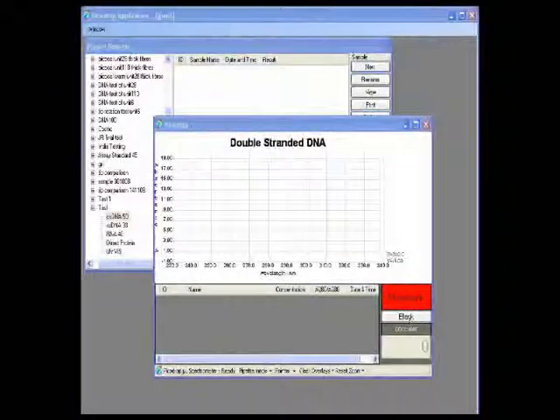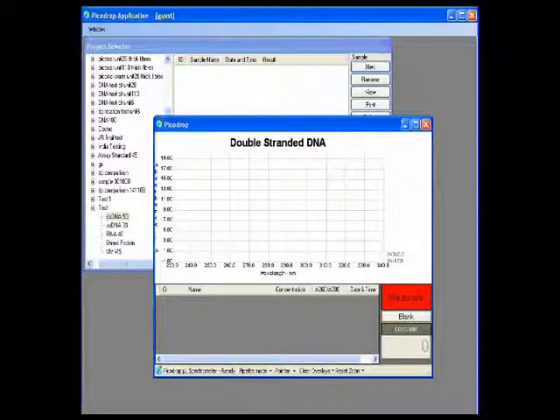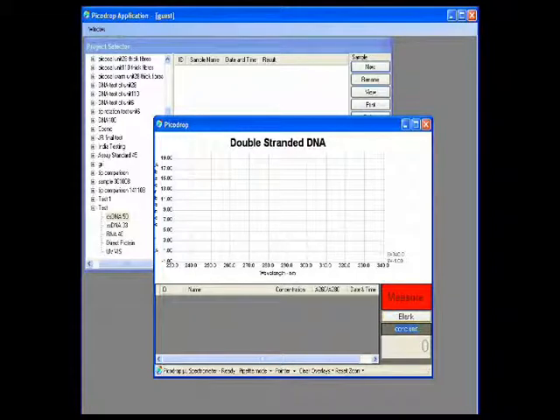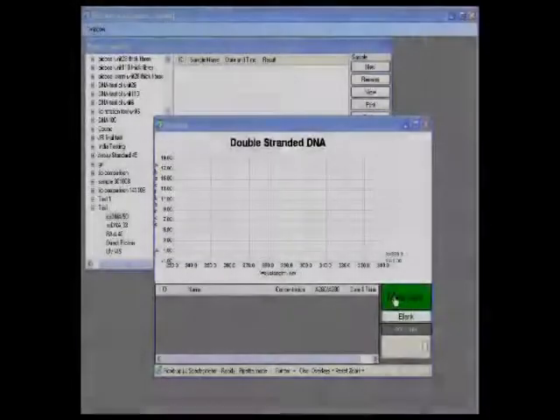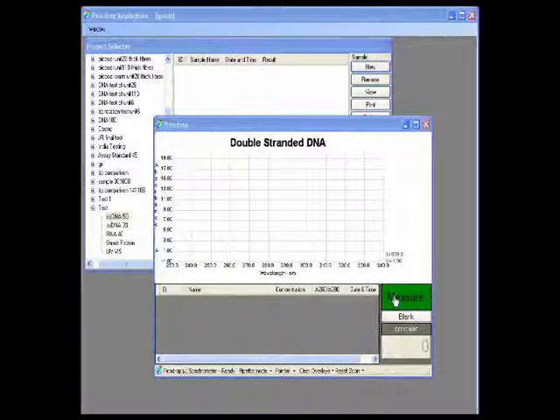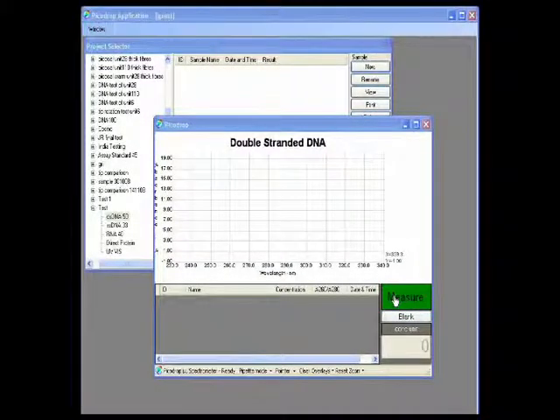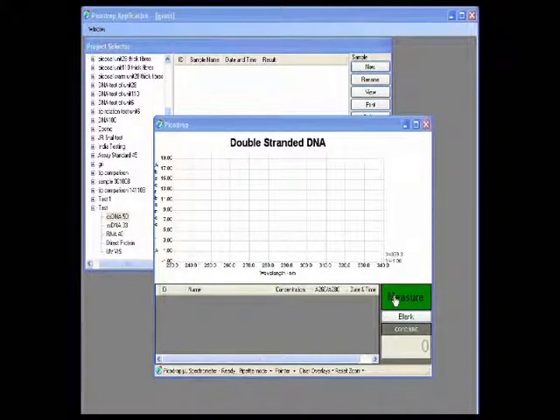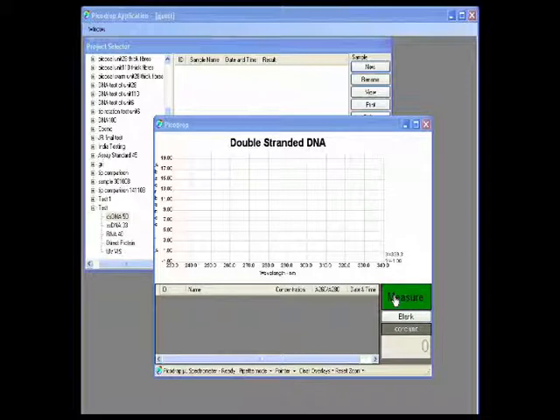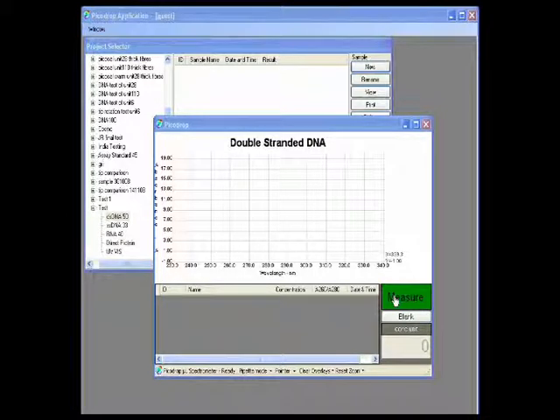Return to the software and press the blank button. Once the blanking is completed, the button indicated on the screen will turn green and read measure.